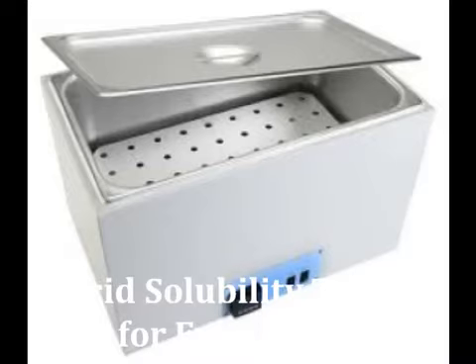The results you want to get from your acid solubility, from the American Petroleum Institute recommended practices, for sand sizes of 6/12 through 30/50, those are mesh sizes, for frac sand, you want less than 2% of the mass as being soluble in the acid. And sieve sizes 40/70 through 70/140, you want less than 3%. So the acid solubility test is one of the many tests performed to determine whether or not you have frac sand.